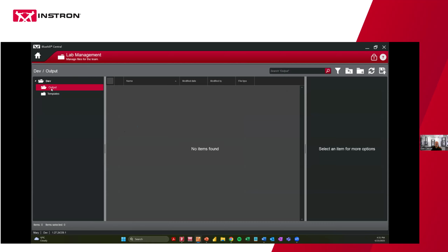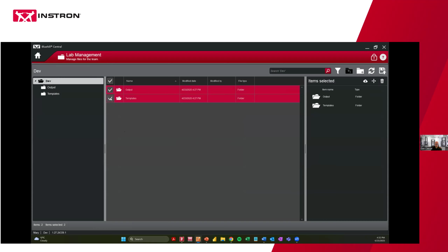It's just folders that we recommend if, hey, how am I going to manage the files that people are going to be accessing on the test system? Maybe you want to have an area where they go for templates. Maybe an area where they're saving samples and output data. But if you don't care about these folders, you can throw them away and create your own structure.